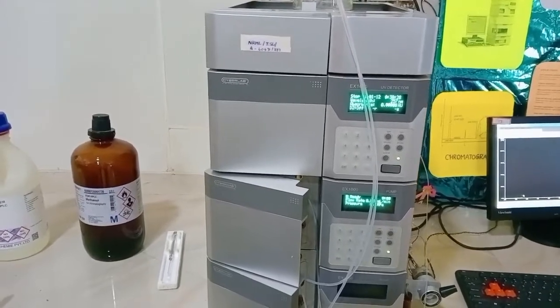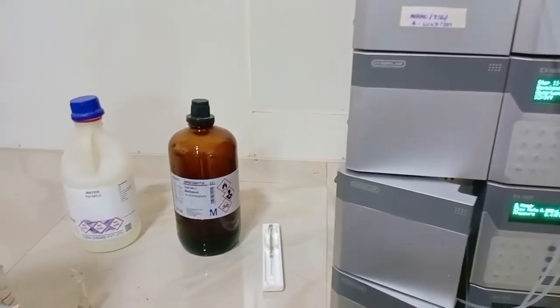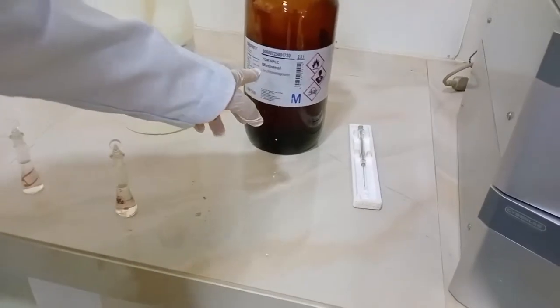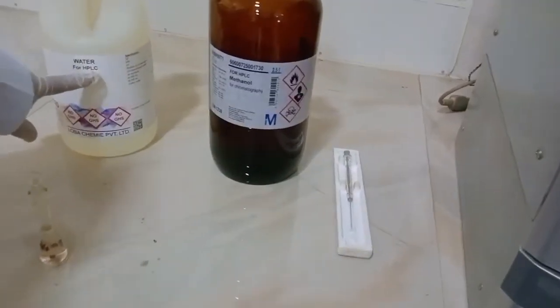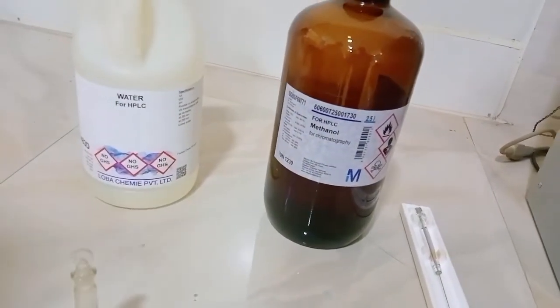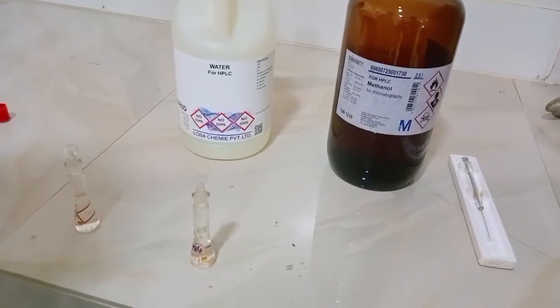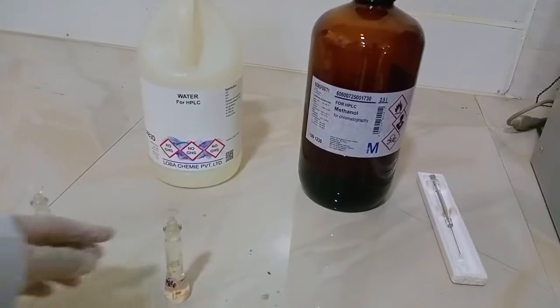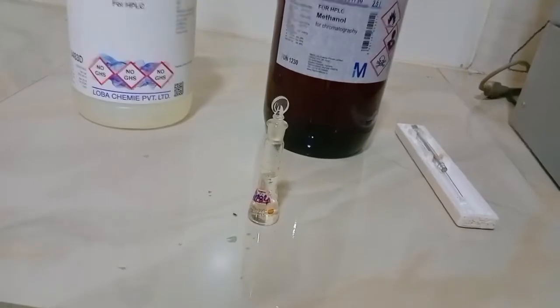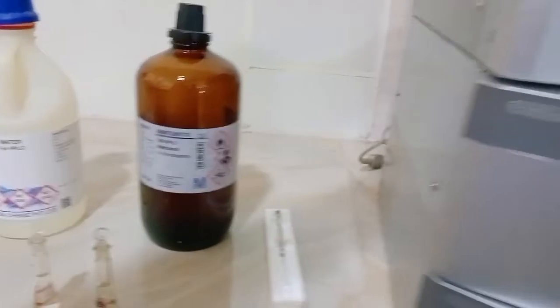Coming to the analysis of the sample, today we are observing the analysis of the paracetamol drug substance. For the estimation of paracetamol by HPLC, you can use methanol and water in the ratio of 50:50 as solvent. You can use HPLC grade solvents. After mixing the 50:50 mobile phase, the mobile phase was degassed using the ultrasonicator. After that, the sample was dissolved in the mobile phase at concentrations of 10 microgram per ml and 20 microgram per ml. The mobile phase was filled into the mobile phase reservoir.